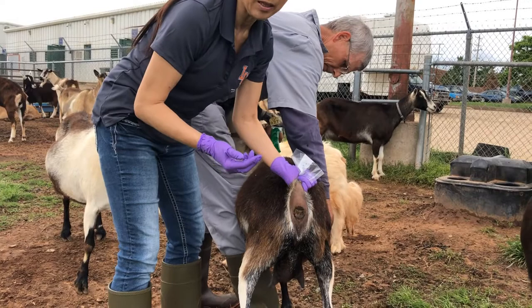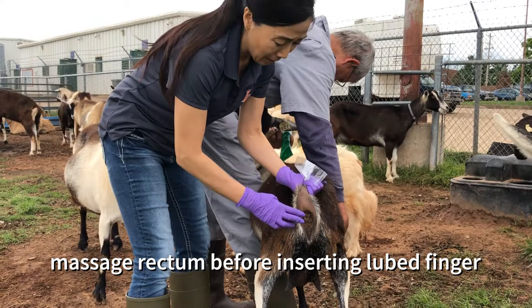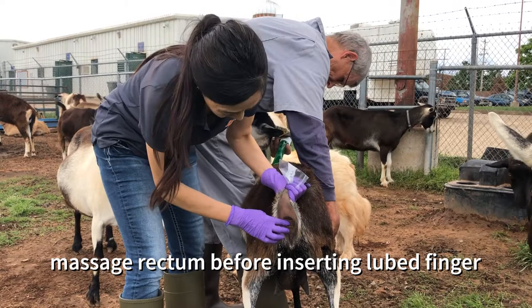Goats probably don't want it the first time, so you don't want to put the finger in immediately. Just kind of ease them a little bit, then you can put your finger in there.